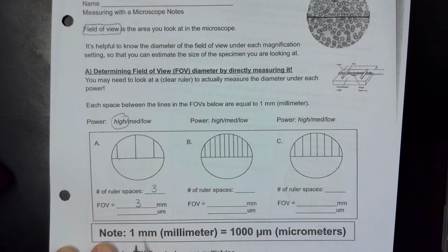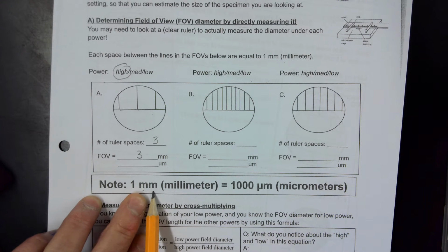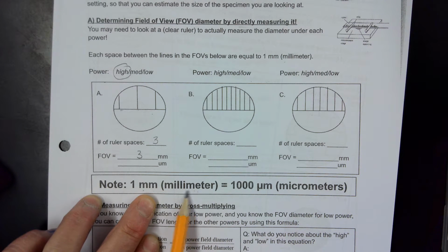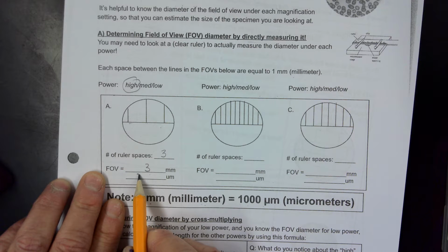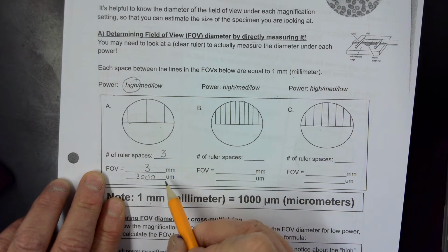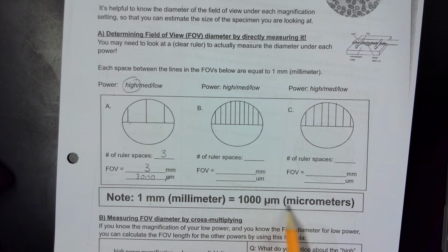Now, even 1 millimeter is a very big measurement when you look at it under a microscope, even though in reality 1 millimeter is very small for us as humans. So it's going to be helpful to know that 1 millimeter is 1,000 micrometers. If you've measured your field of view to be 3 millimeters, that is the same thing as saying 3,000 micrometers. The funny little u in front of that is the symbol for micrometers.